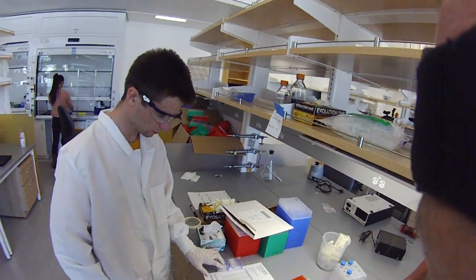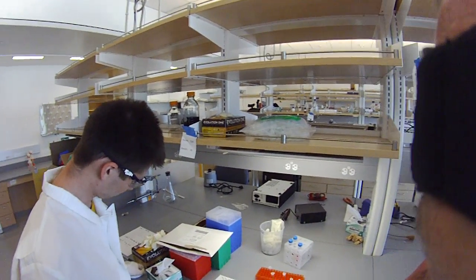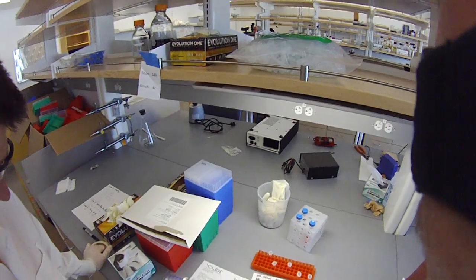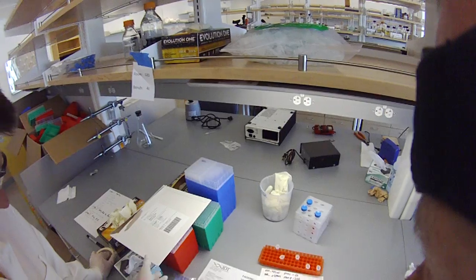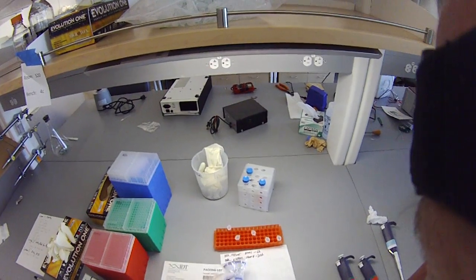We did a bunch of design and testing of our oligos in silico to make sure that everything should assemble properly. We've now ordered a bunch of oligos from IDT, and they sent them to us overnight. We have a sheet of paper describing the oligos we ordered, and then a bunch of little tubes.